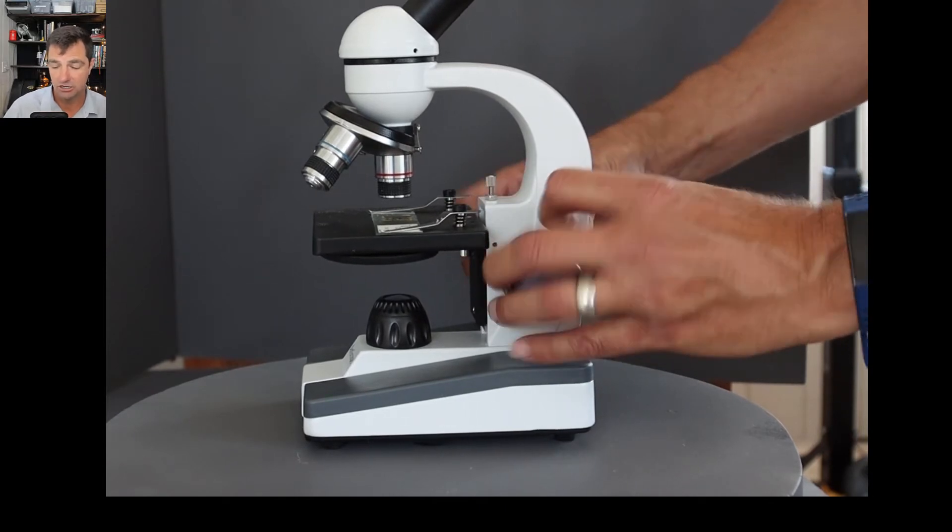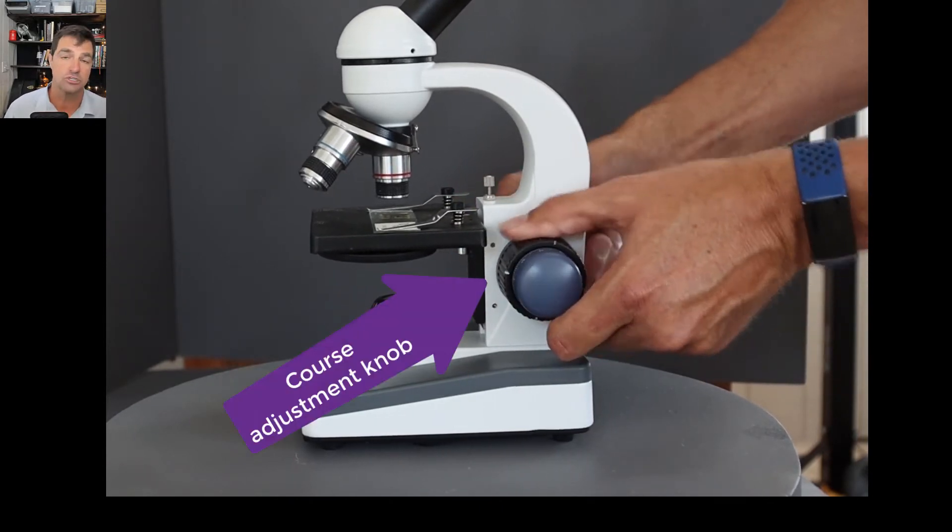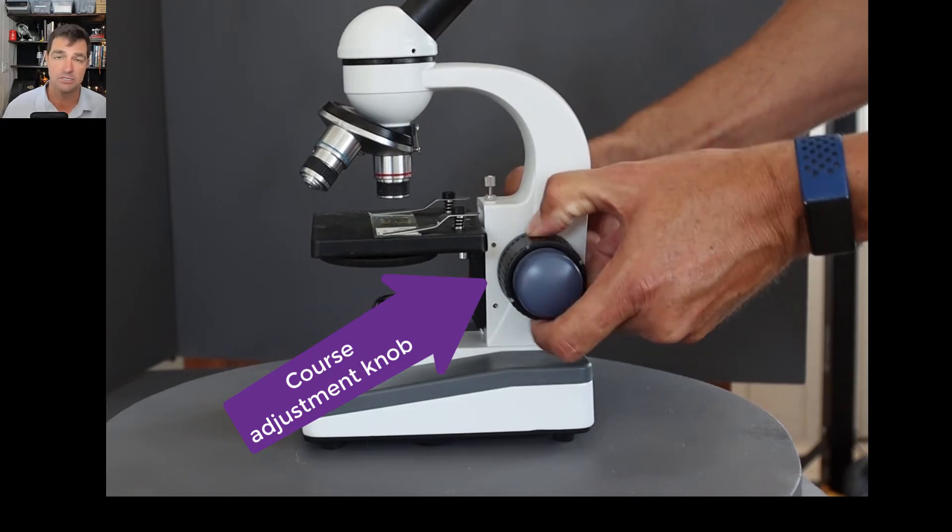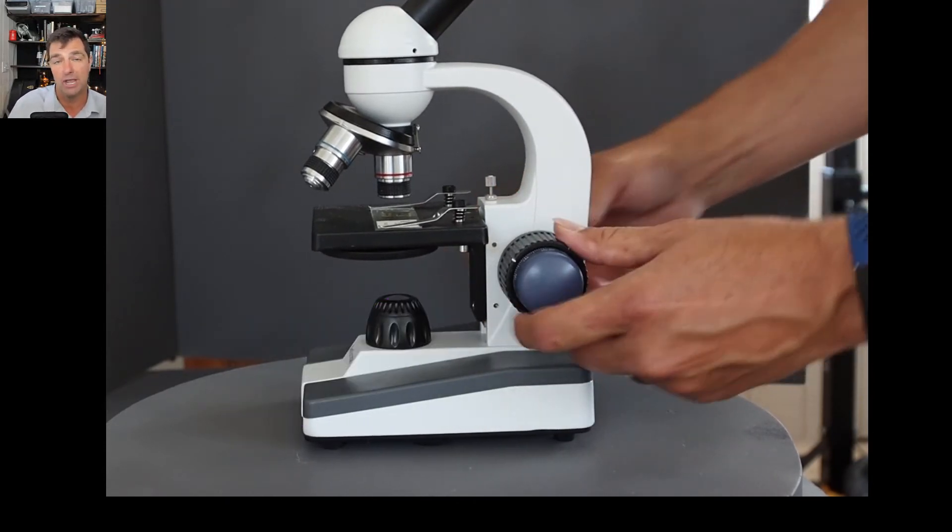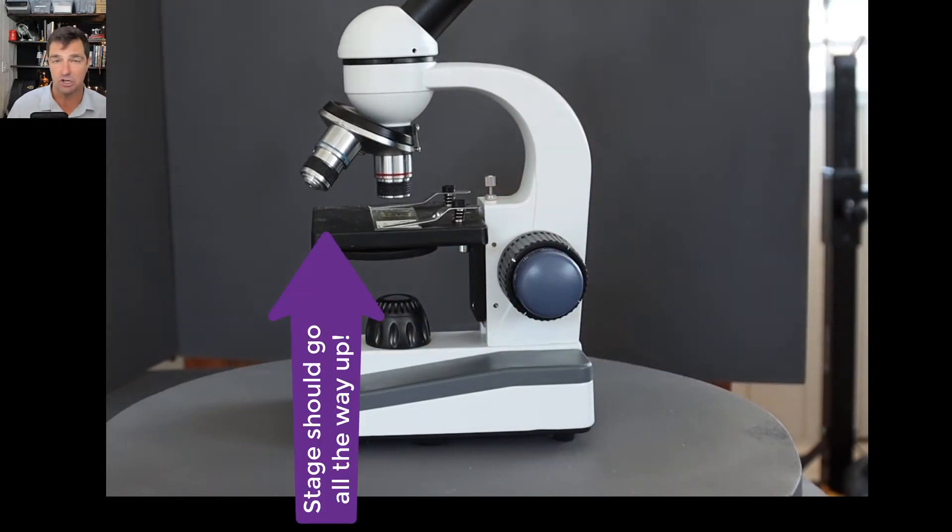Put your slide on and turn the stage using the course adjustment knob, the innermost larger knobs, and turn the stage all the way up. Do all this without even looking through the microscope.